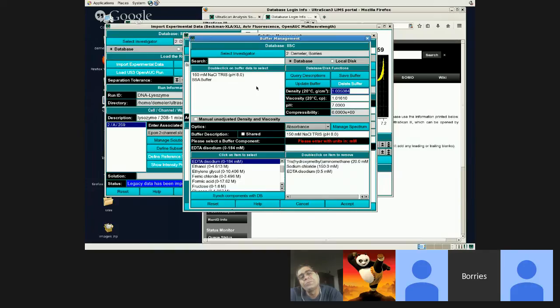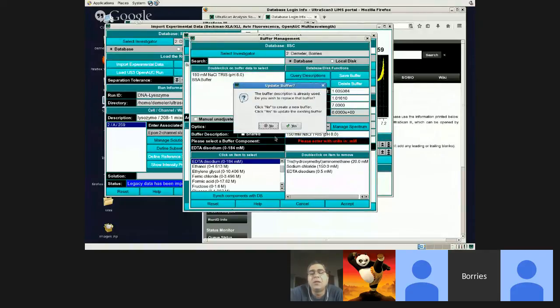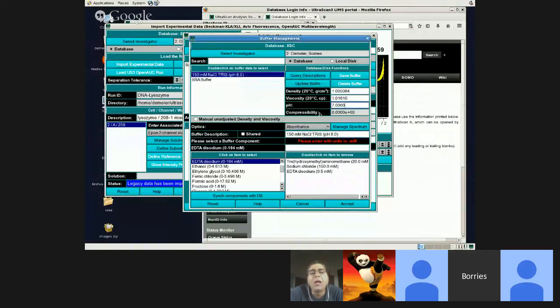Go ahead, Siddhartha. Does it correct for the pH also? Because your buffer is pH 8 and here it says pH 7. So this pH 8, I just typed in the listing here. So I really should type in 8, right? It doesn't correct for the pH because the pH generally doesn't affect the viscosity or density.